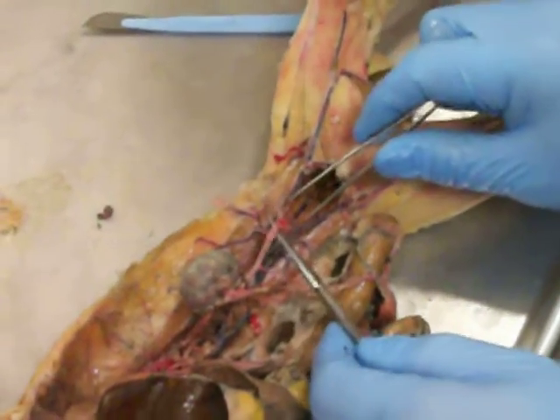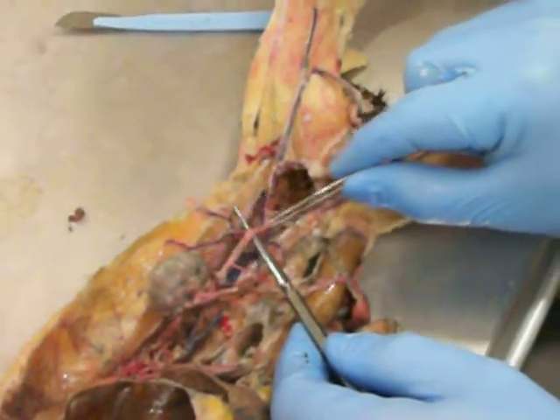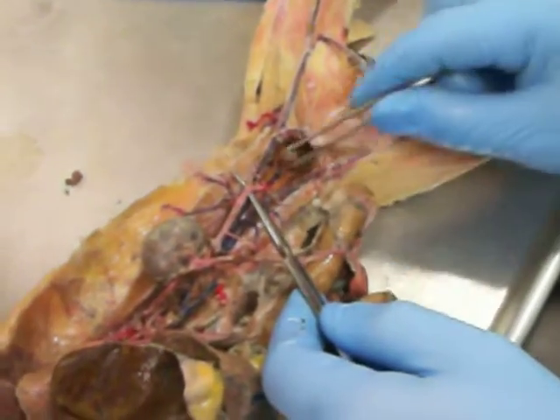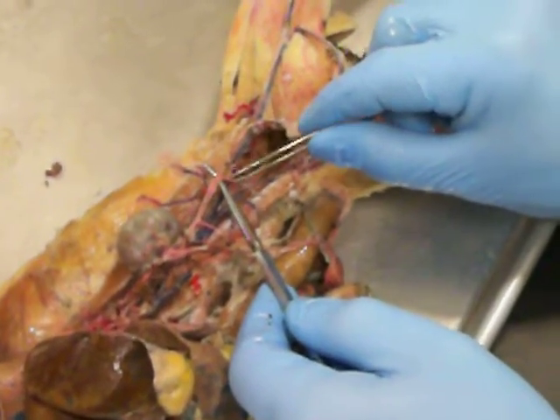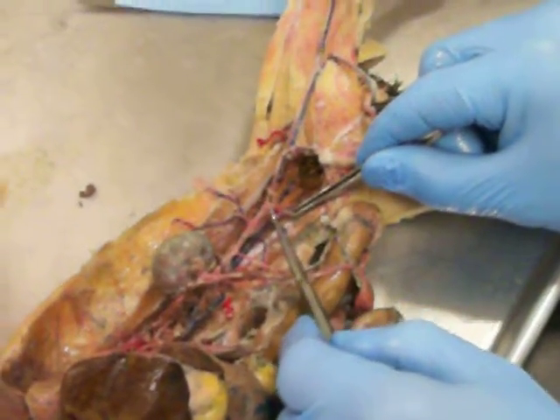And then here we again have our descending aorta. And now at this point it's going to branch a couple of times. And this cat looks decent to show this. But you can see the first branch here. This is external iliac artery, left and right. Here's our other one that's broken. Then it continues for a short distance right here.